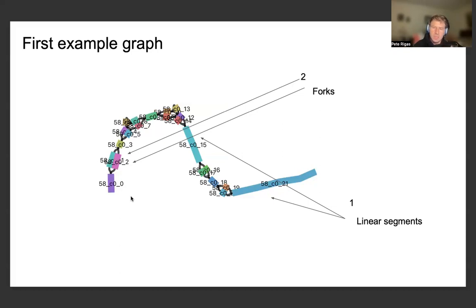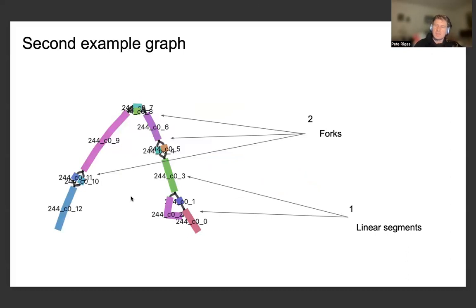that shows us how different components, depending upon the degree of each one of the nodes or vertices in the graph, can help us interpret and look at different types of sequences and candidates for sequences that are produced in the FASTA file from a transcriptome assembly. Besides this first graph example, there's also a second graph example, which has many similar qualities to what I mentioned in the previous slide.